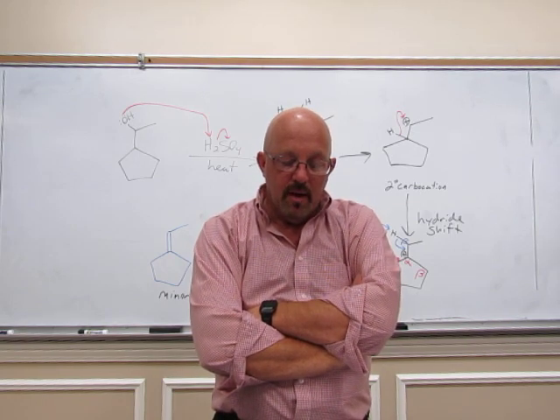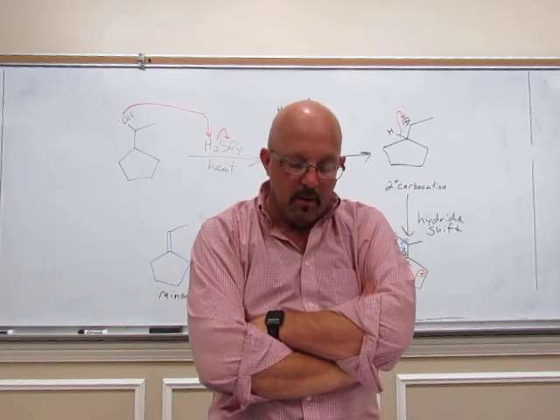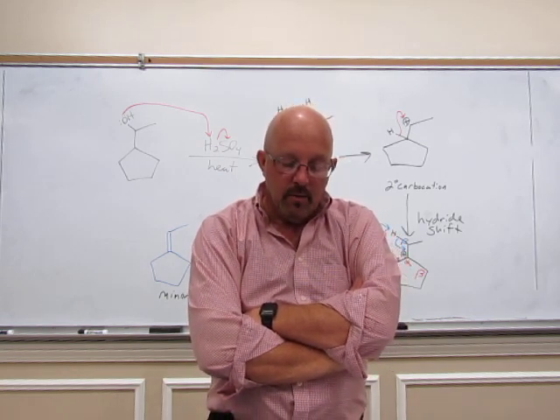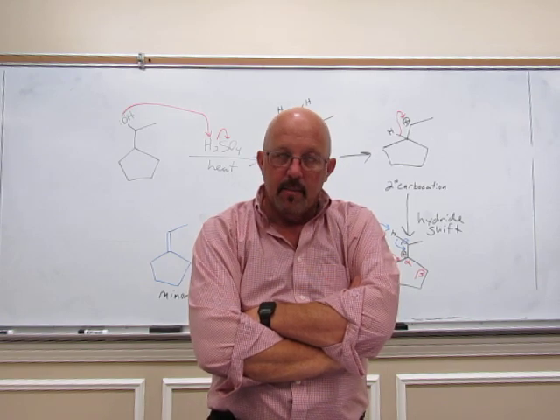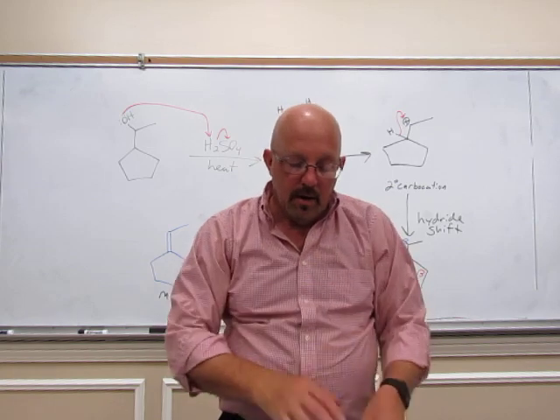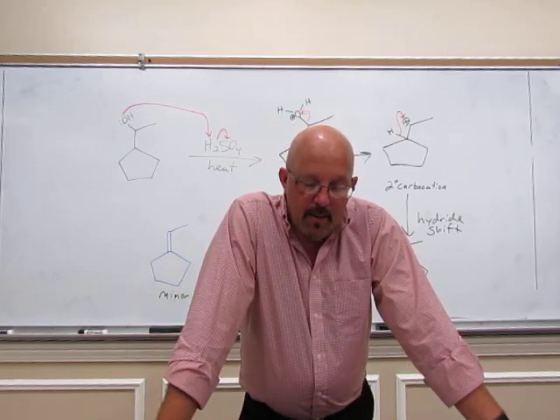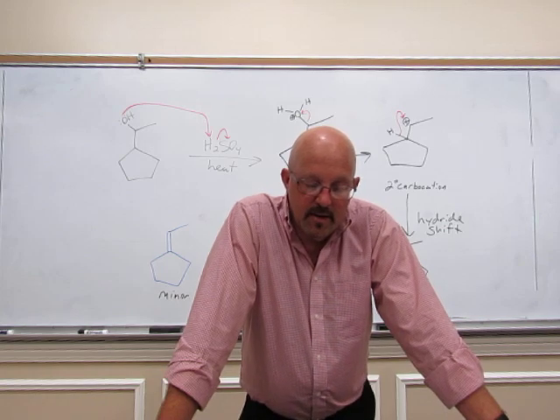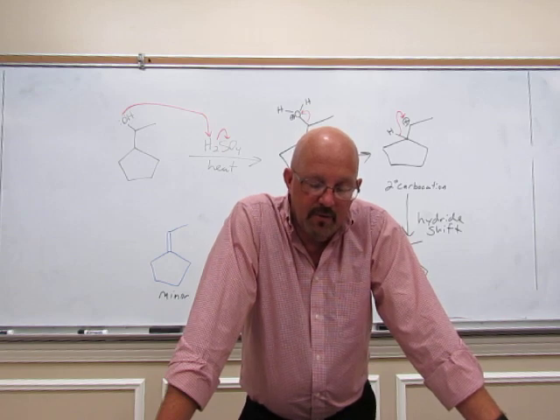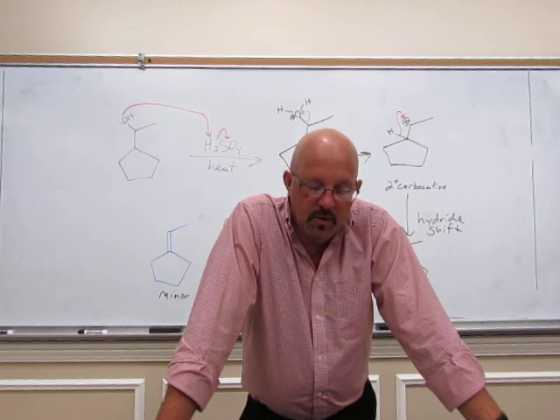Now, once you've removed the water layer, you'll dry the organic layer over anhydrous calcium chloride pellets. And while that's drying, you're going to clean your distillation apparatus. We're going to distill a second time to purify the products, and it tells you how to clean out everything. We'll set it up and do a second distillation. Transfer the dry mixture after we've dried it with calcium chloride pellets back to the distillation flask, and we'll add a boiling chip and distill again.